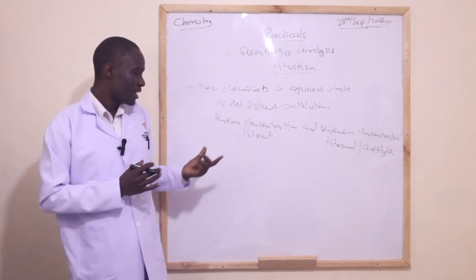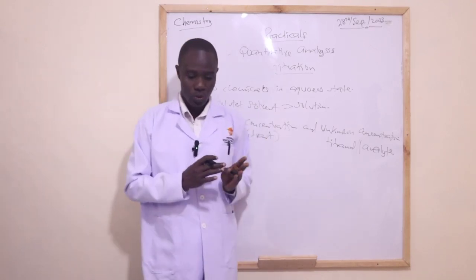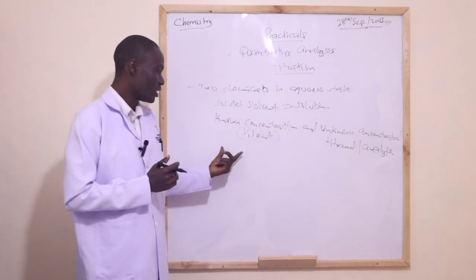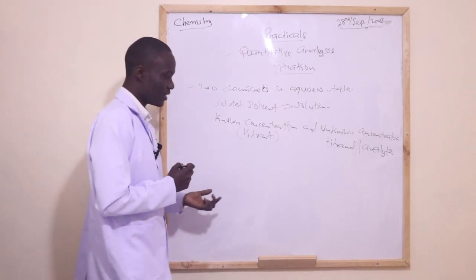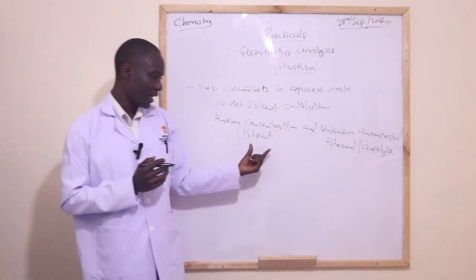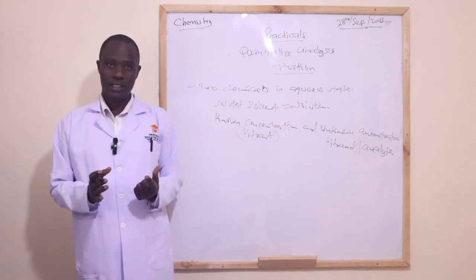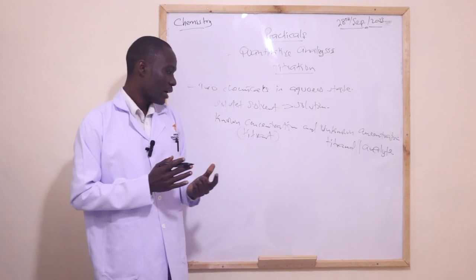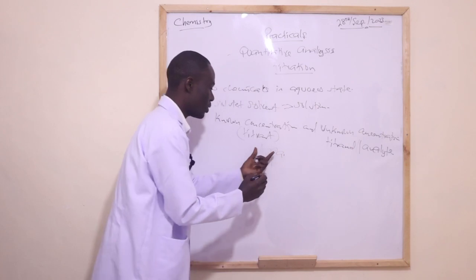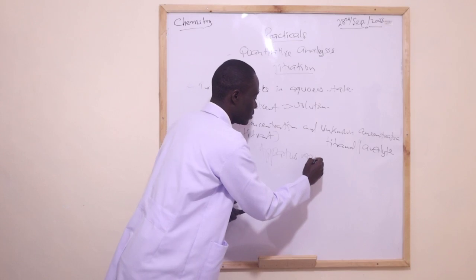Now, even as we titrate, I want us to go through the apparatus that are normally used during titration, because it is very important that a candidate or a learner of science acquaint themselves with the main apparatus that are used in the lab. So, apparatus required or used.